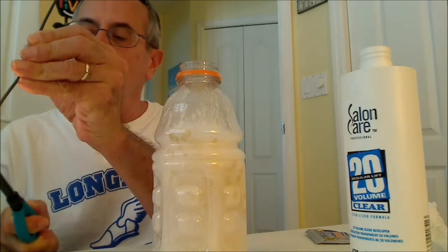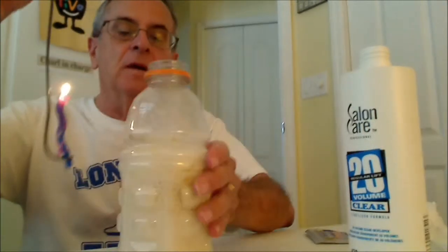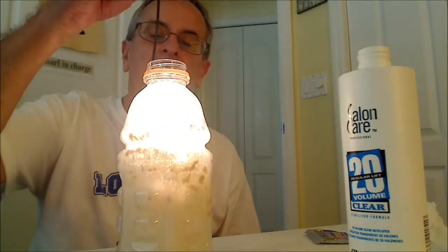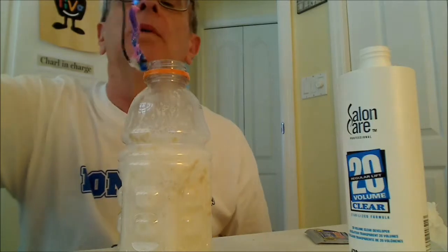Now I'm going to use a candle. The candle will not give off as much smoke. So when we put the candle in there, you can see it glows very brightly. And you can blow it out.